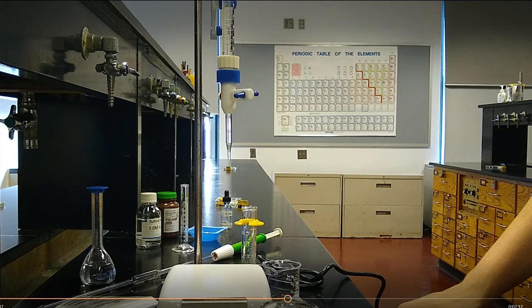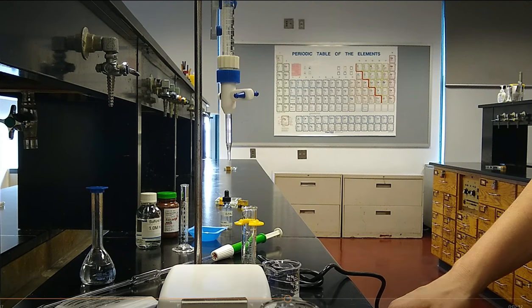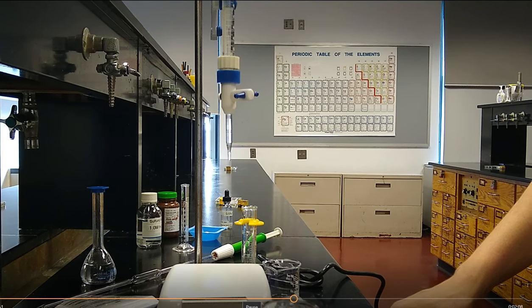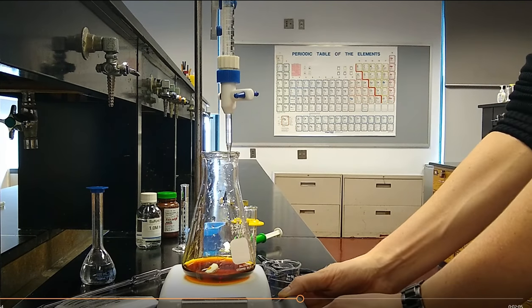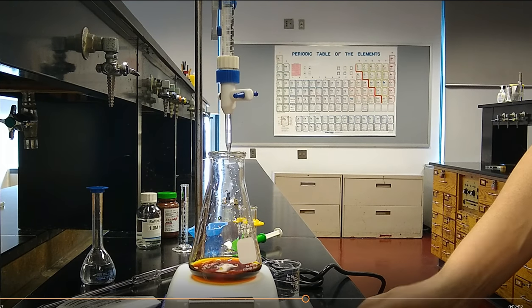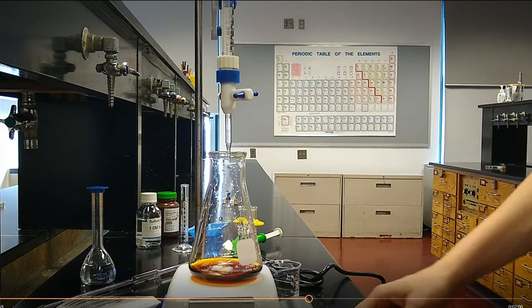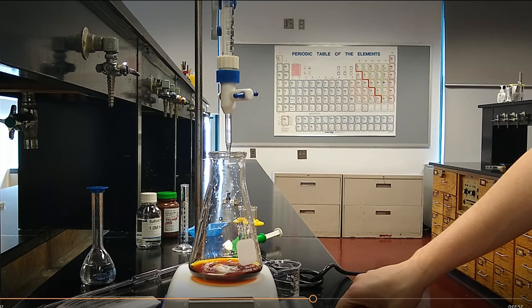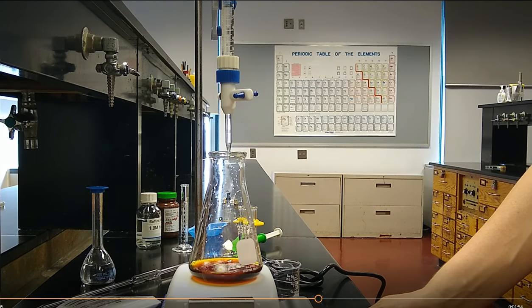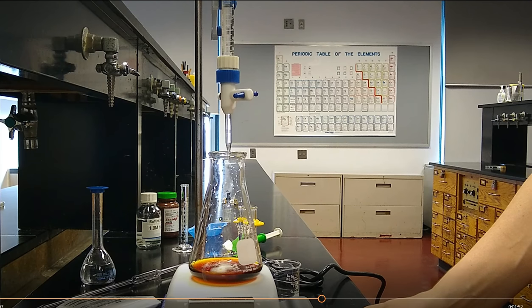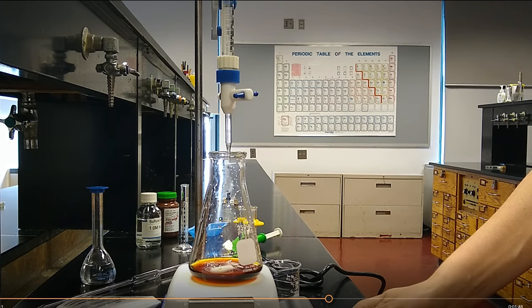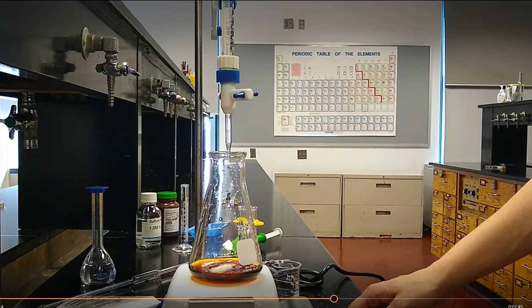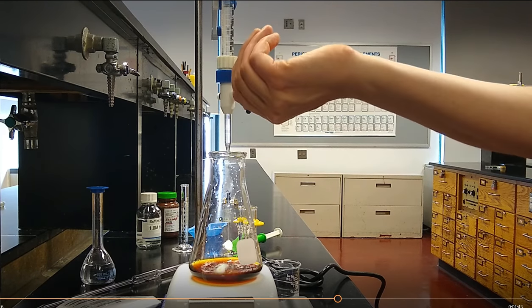Okay, let's backtrack to question number three. We got those four pictures of Erlenmeyer flasks. In that first Erlenmeyer flask, what color do you see? We've got this reddish brown, so I'd write that in the volume of the Erlenmeyer flask all the way to the left. When you set up the stir bar, you don't want it stirring so fast that it's splattering all over the place, or so slowly that it's not really doing much of anything. You want to find that happy in between. And that number is going to be a little bit different on everybody's stir bar.